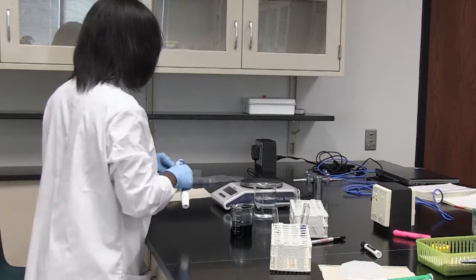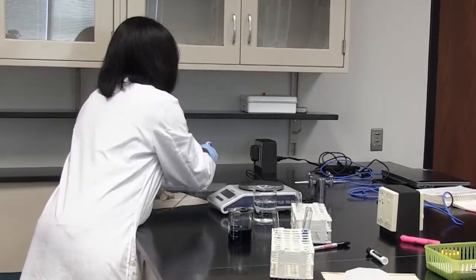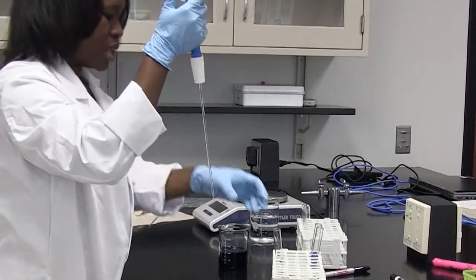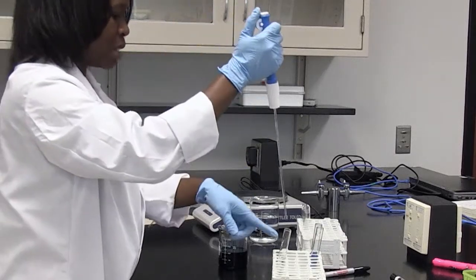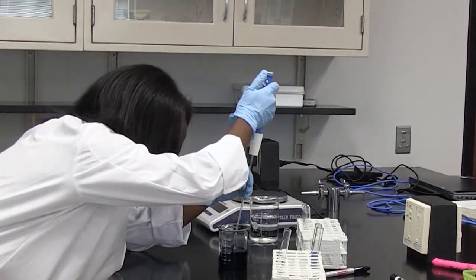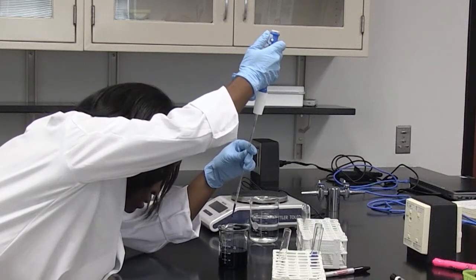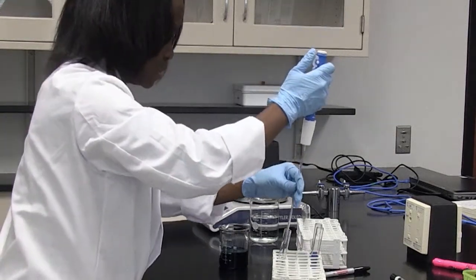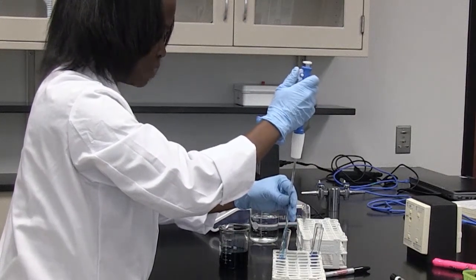Because I have some liquid already in this serological pipette, I'm just going to change it. Then I'm going to add 0.1 ml of stock dye to my 9.9 ml of water in the third test tube, and pipette up and down carefully again.